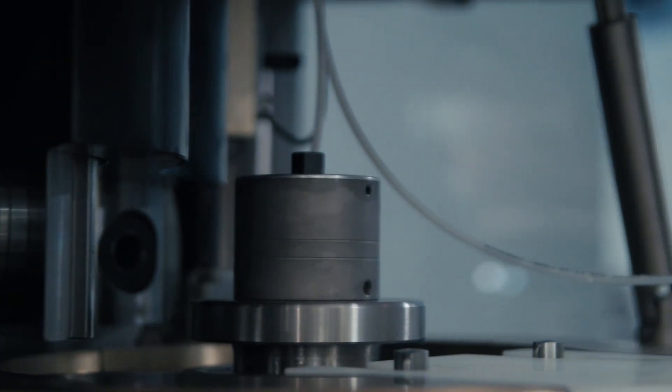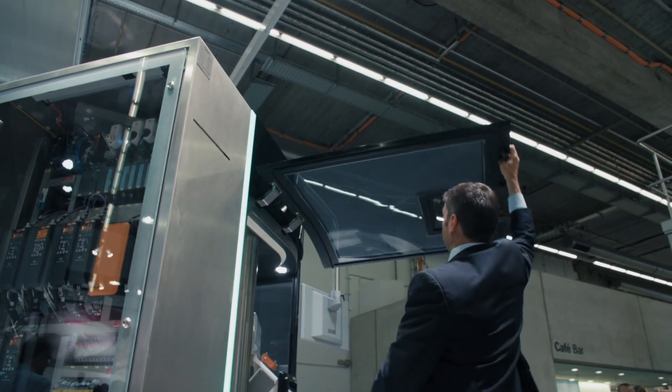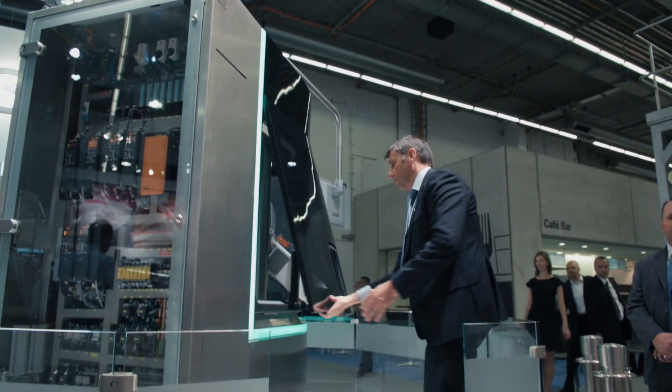This machine is now officially launched into the market and will be released for sale in a couple of months, with the first machines able to be delivered by the beginning of next year. In the meantime, customers can come and do trials in our facility in Belgium to test their own formulation and see how well this machine performs compared to what they know today.